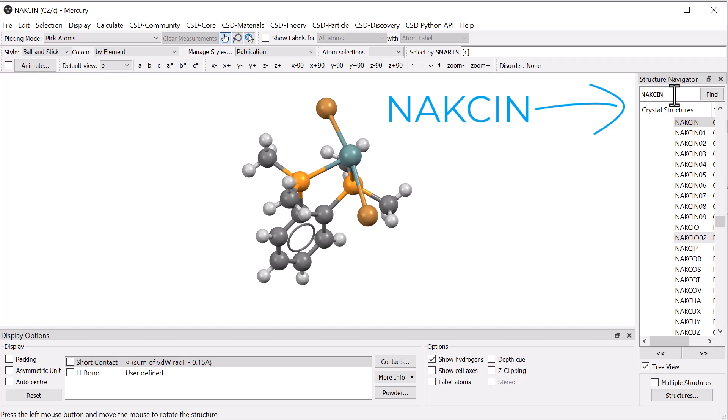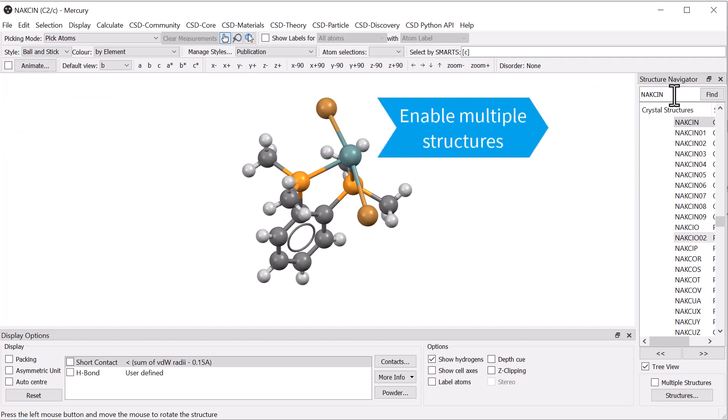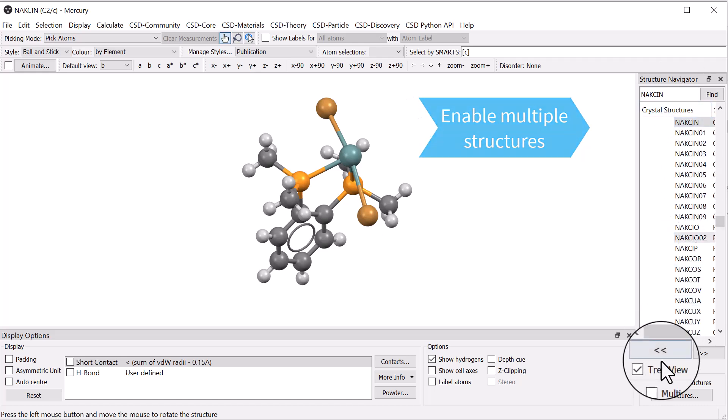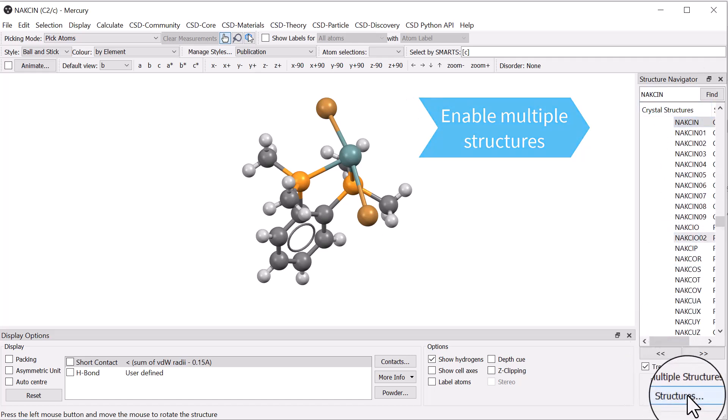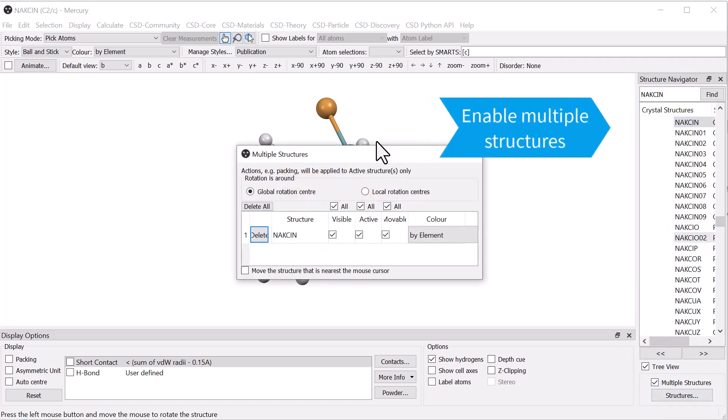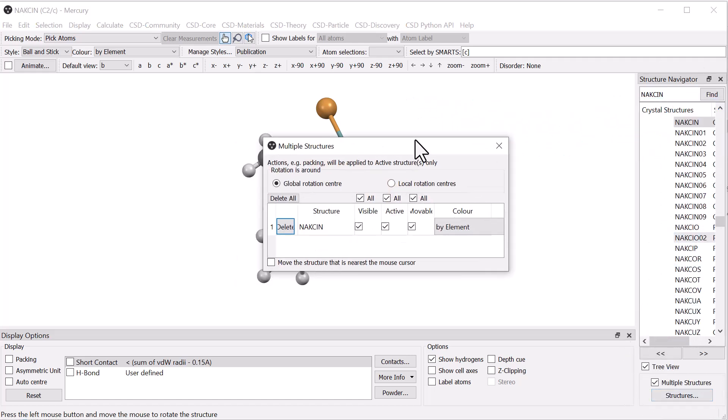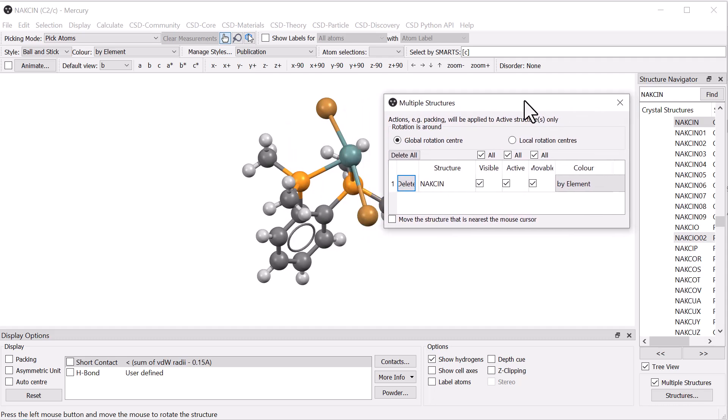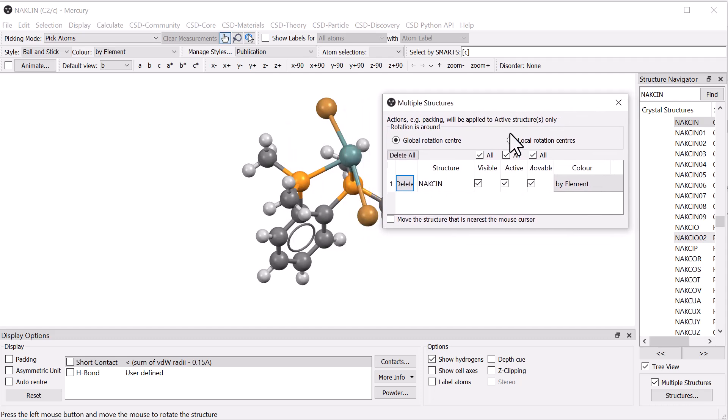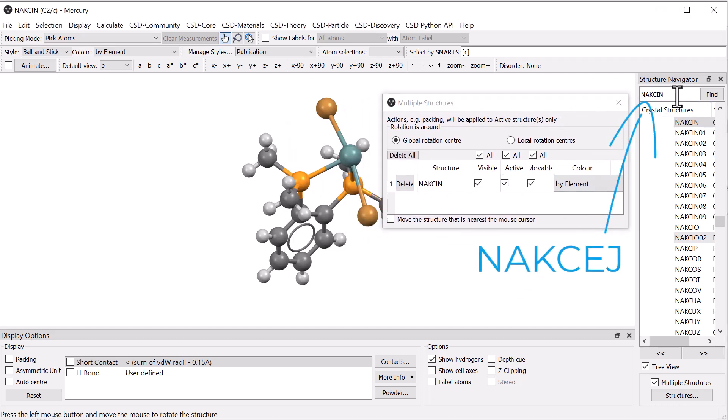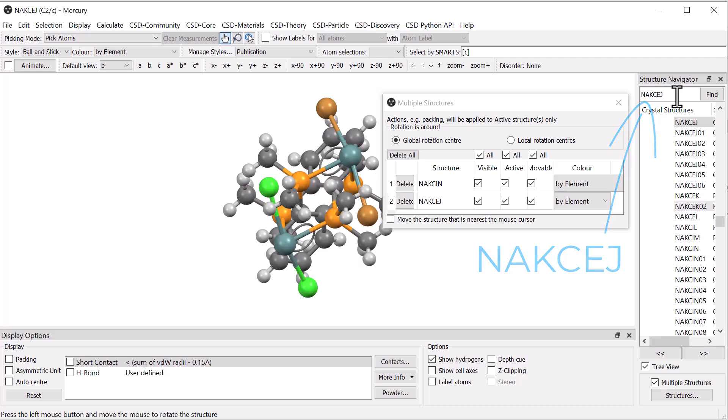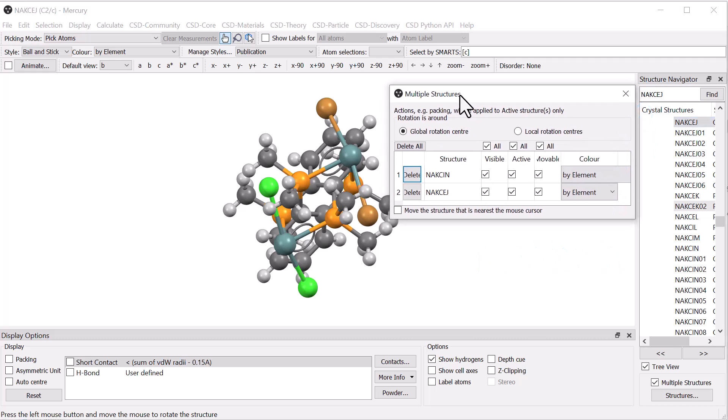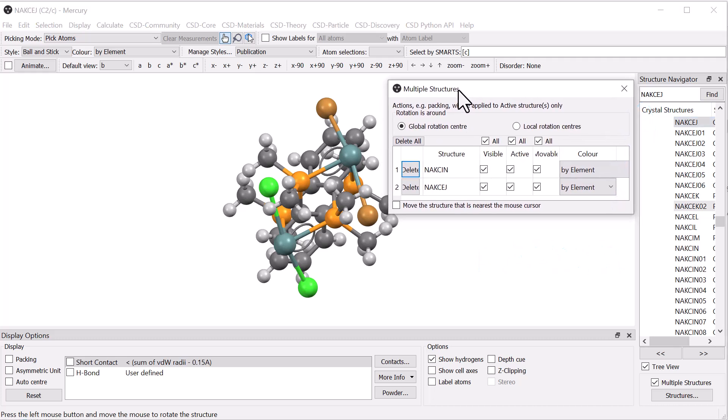Now that one structure is loaded, tick multiple structures and click structures to open up the multiple structures window. Type the second ref code NAKCEJ in the structure navigator and you will see that it has now appeared in the multiple structures window and also in the main visualiser area.